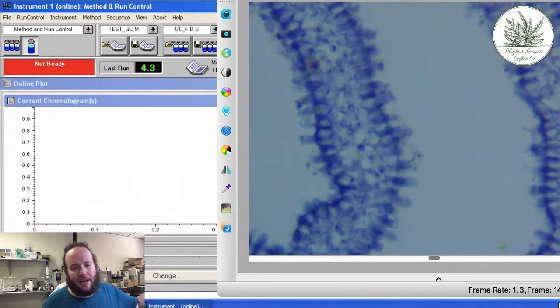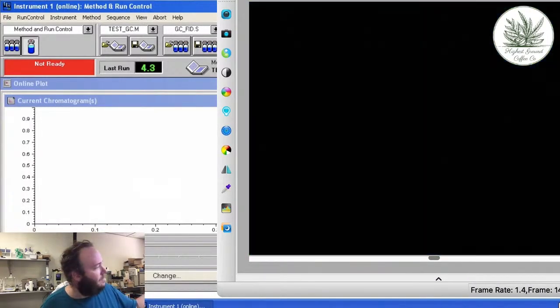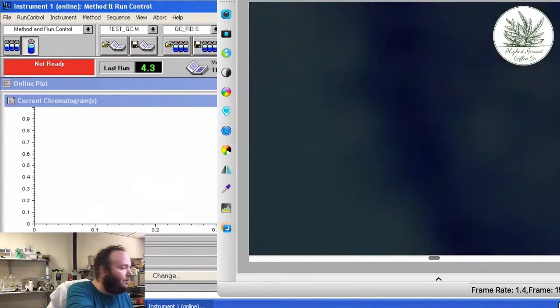So that's the 20. We're going to go all the way up to the 60 objective, which should get us nice and close.